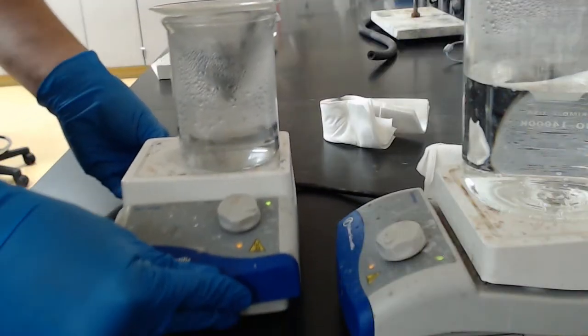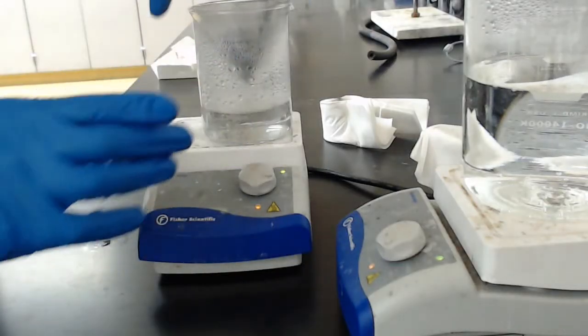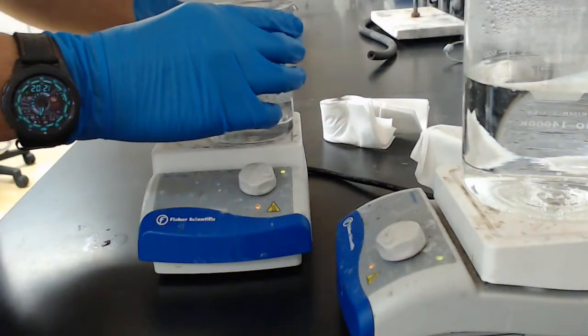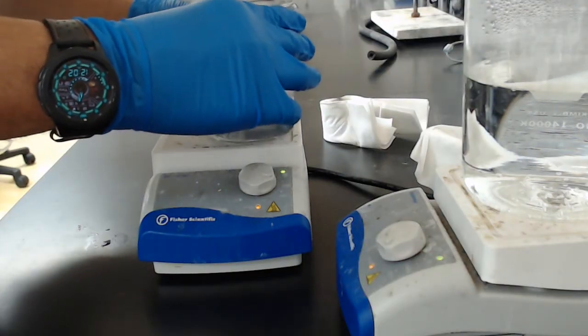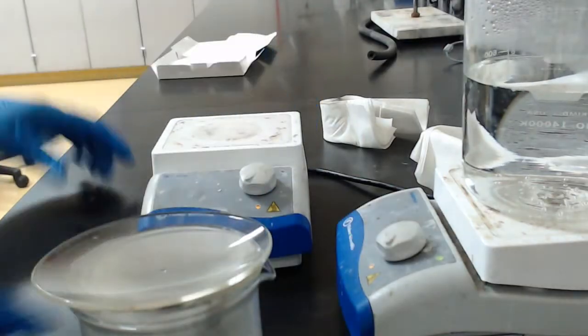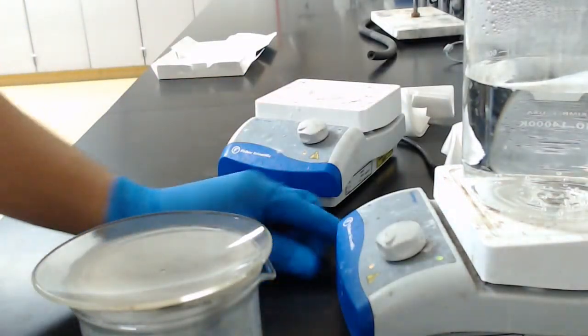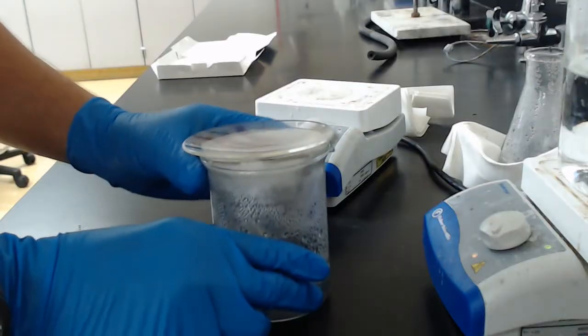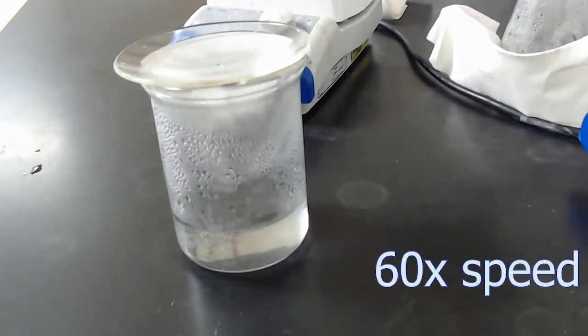So while this finishes draining, there's not much left here. I'm going to go ahead and get an ice bath going. And I'll put this in frame so we can see if we see anything.